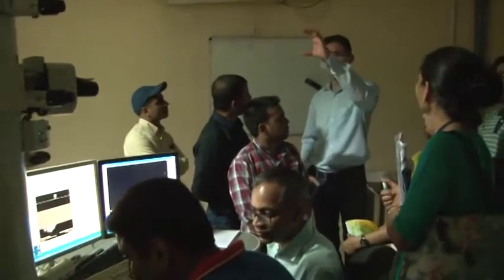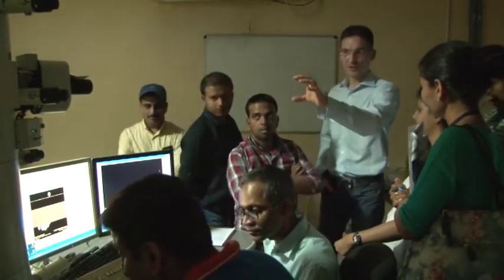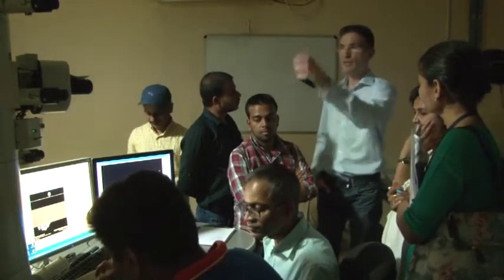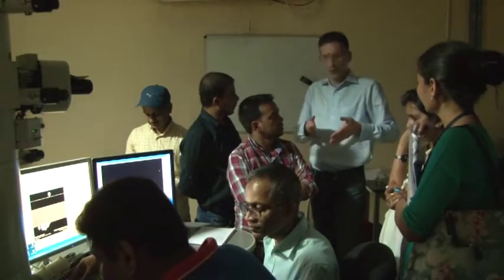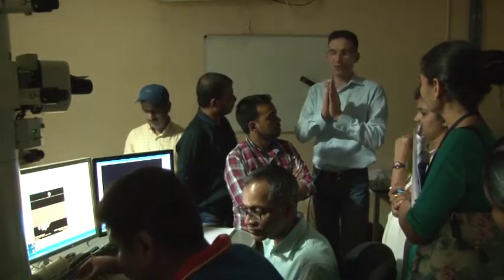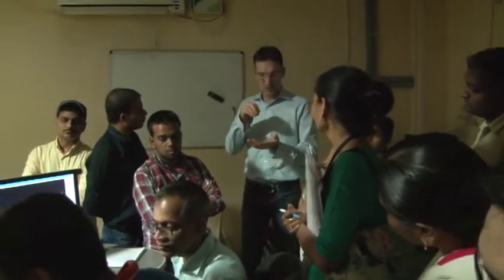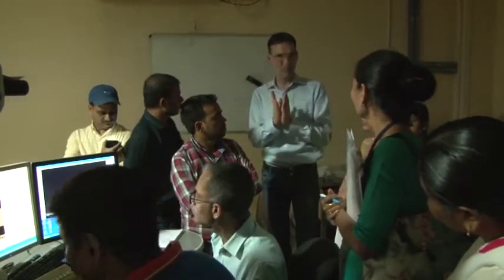Now, we have 2 aberration correctors. In principle, you might have one in the imaging system. This aberration corrector in the imaging system compensates for this here, so for high resolution TEM imaging. If you put the same aberration corrector in the illuminating system, for STEM imaging, you want to form a fine electron probe, but the convergence angle of the probe is limited for atomic resolution imaging, meaning that the current within the probe is limited. And for atomic resolution imaging, you want to have an extremely high current in an extremely small probe.